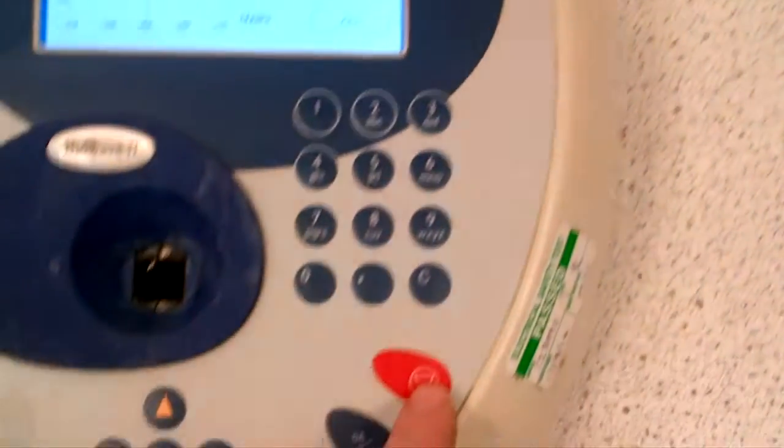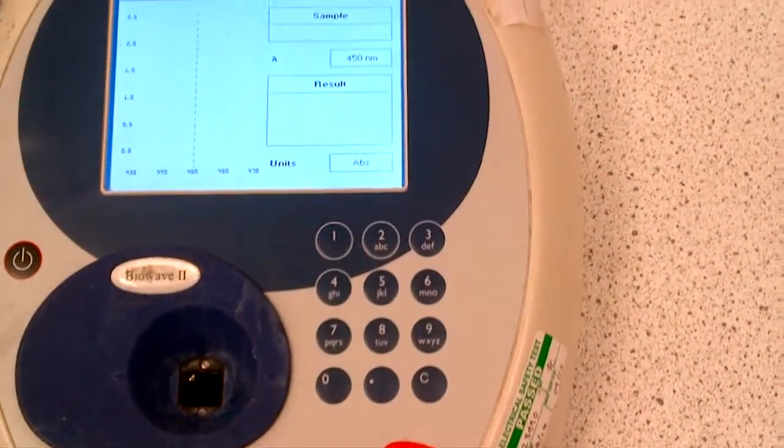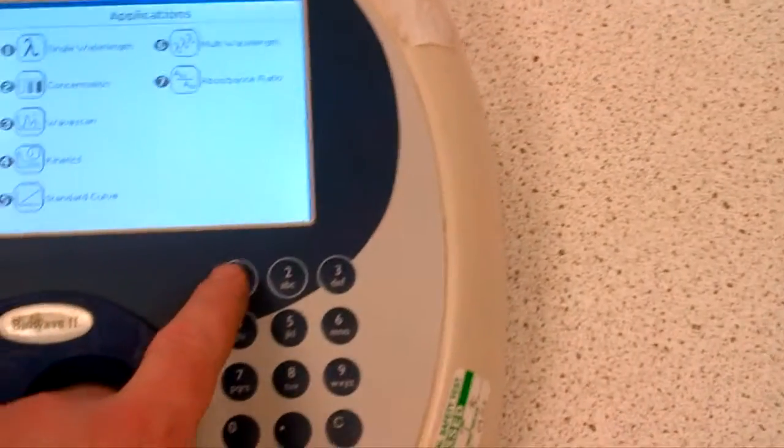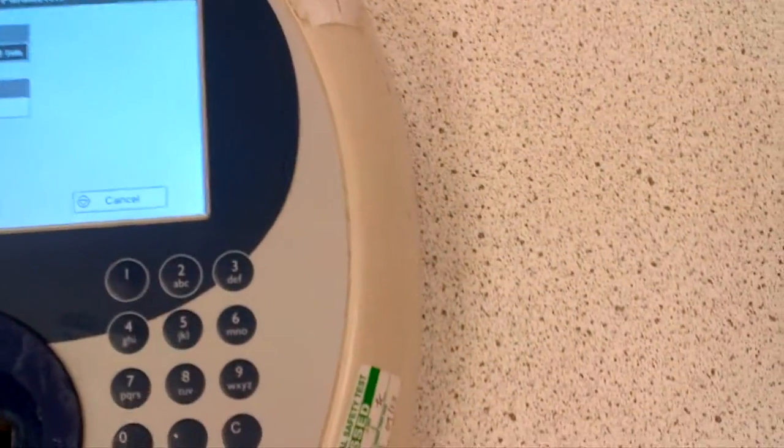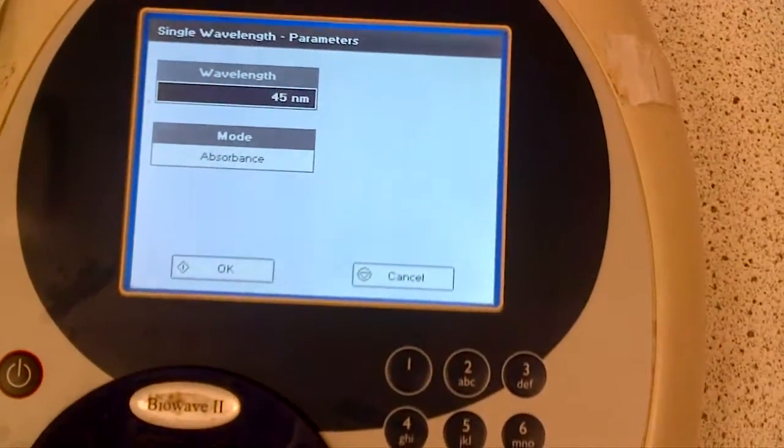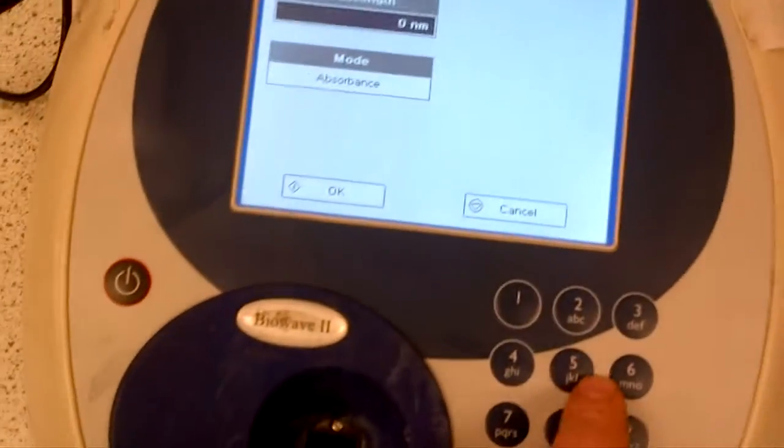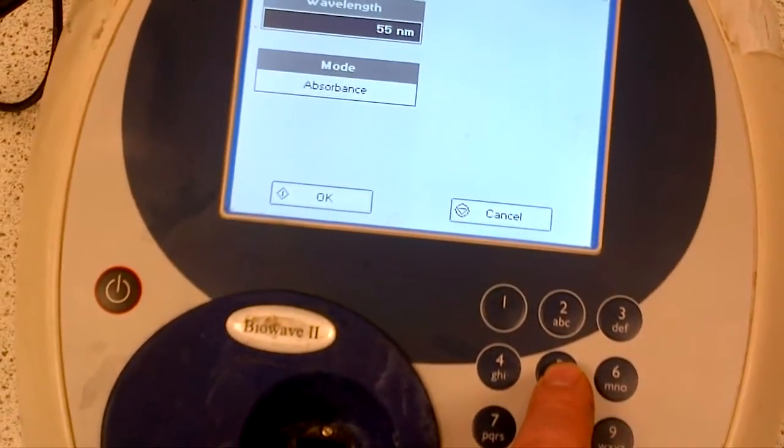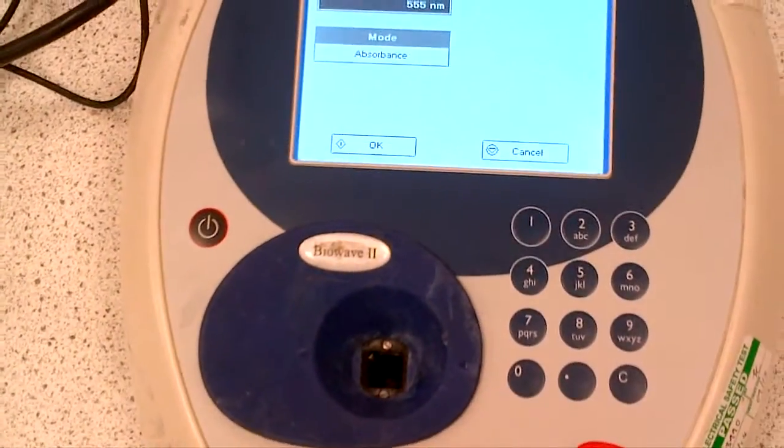If we're unhappy with that, we can go back with the red button, back to single wavelength and change as appropriate. So the C functionality, the C button, goes back and changes wavelength. So we could go for 555 and then press OK again, which is the green button.